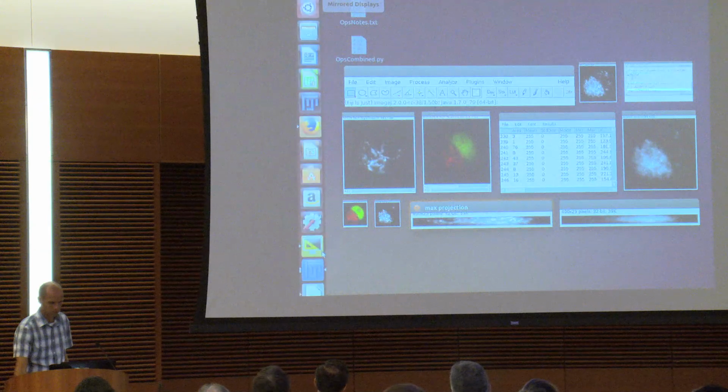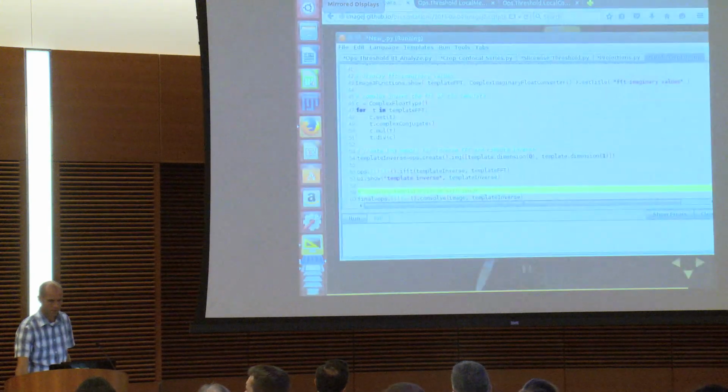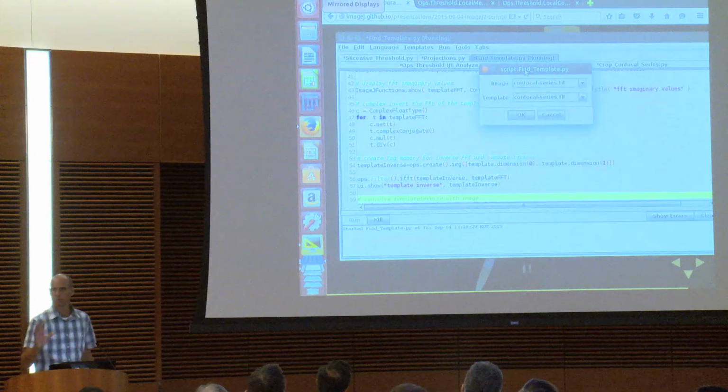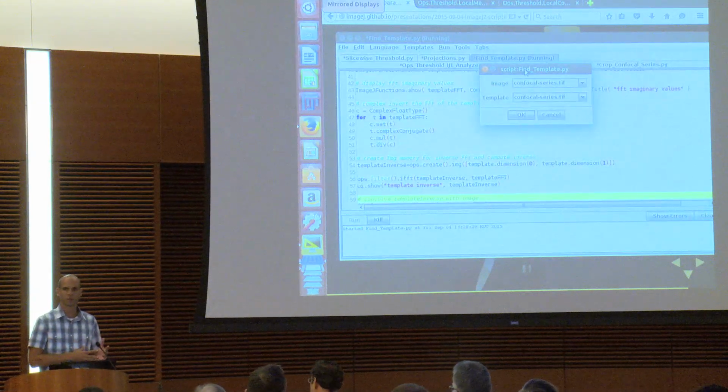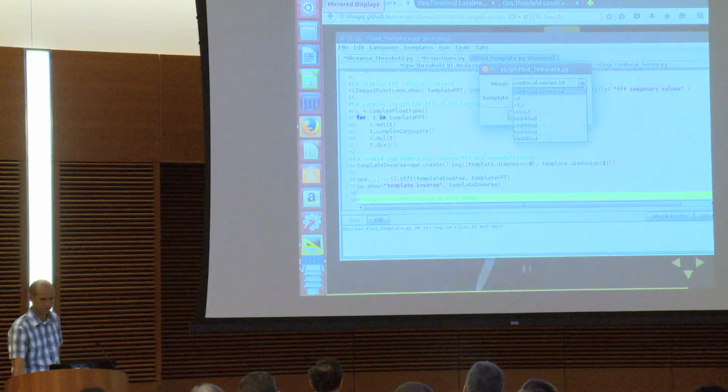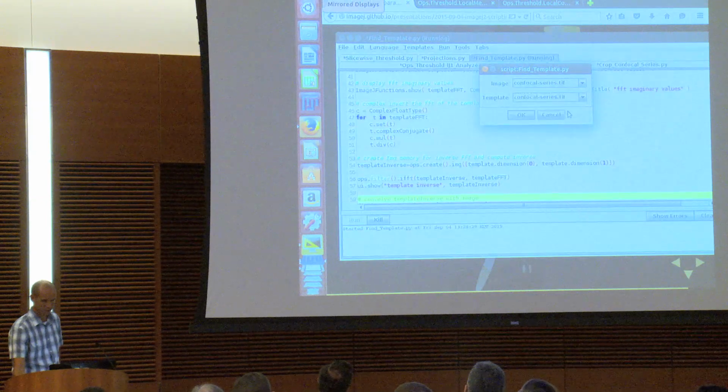Since we've only got a couple minutes, we should probably just show it. So we'll just show this. And the other thing you're going to get to see here, somebody asked this question earlier: if you have two images, it lets you choose them. So I'm going to choose.